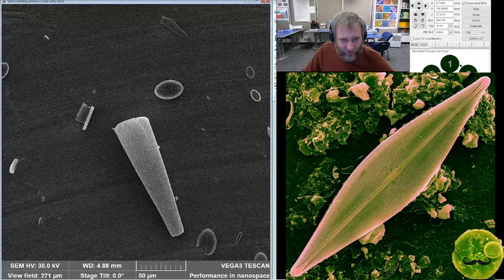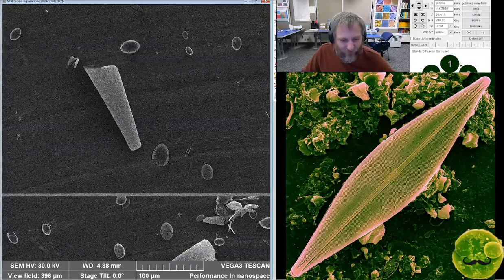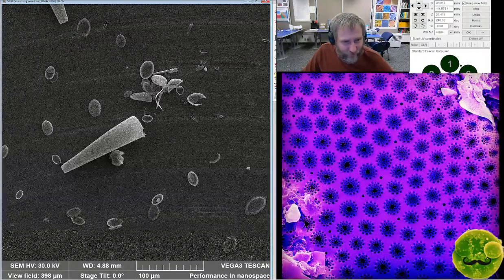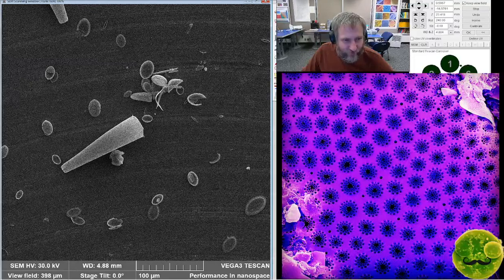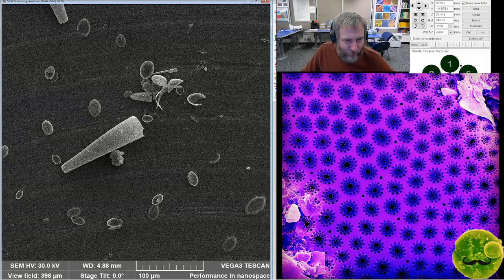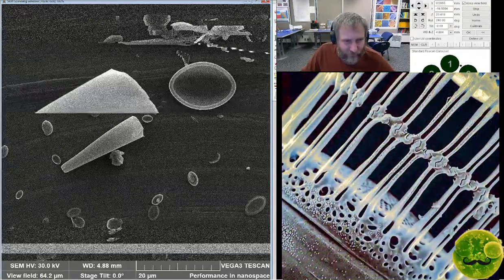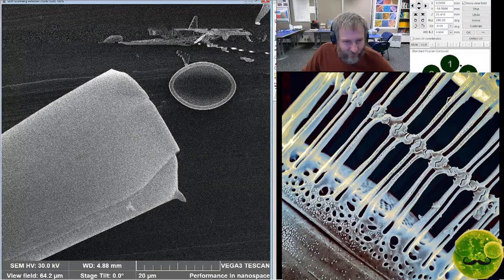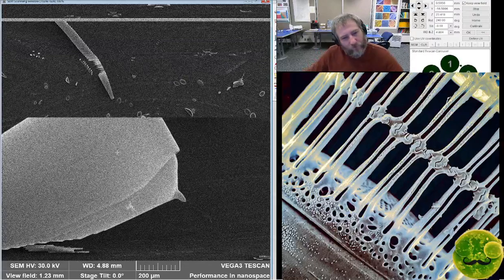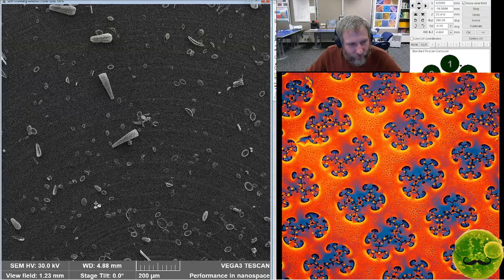You can see it's sticking off of the top end, the head pole, and this one also has a horn on it. It looks like it's just on one side. See that? And the shape of the valve is totally different. This stands really tall. This one has a little tiny bump where there was a horn, it looks like. Those are cool.